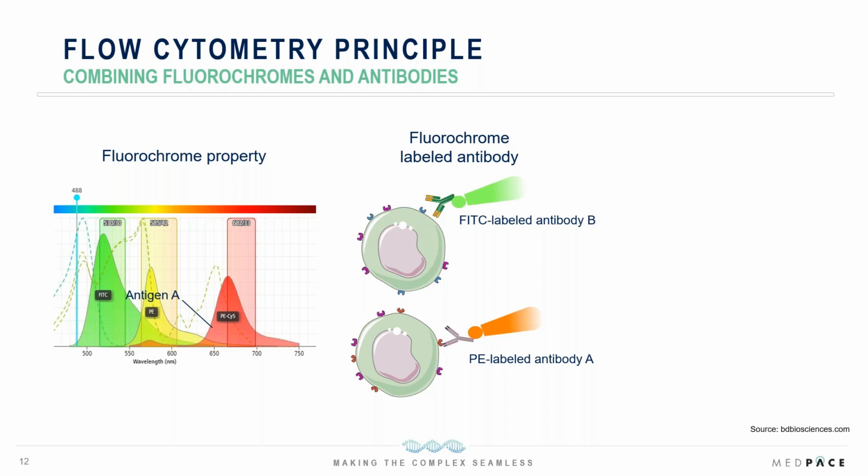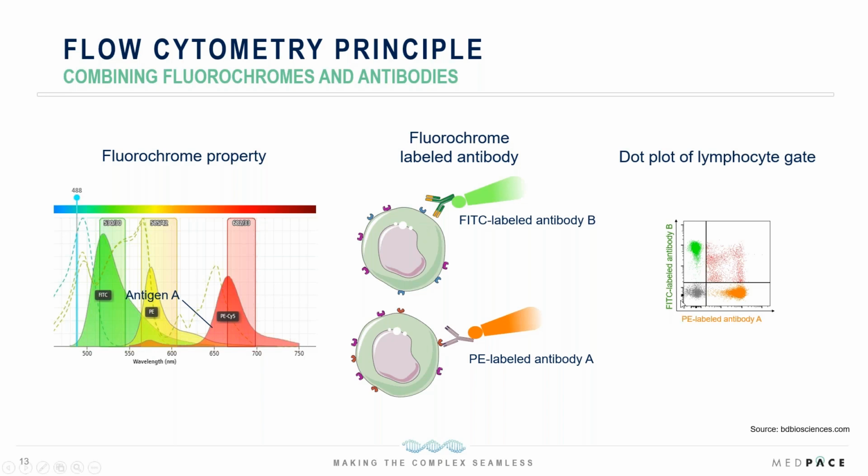And how that looks on the cytometer is that you will have the single positive labeled cell type B show up in this dot plot, and those cells are different from the single positive labeled cells that have the antibody A. So just with two antibodies alone, you can identify 4 different cell populations. Quite powerful just through that simple setup.